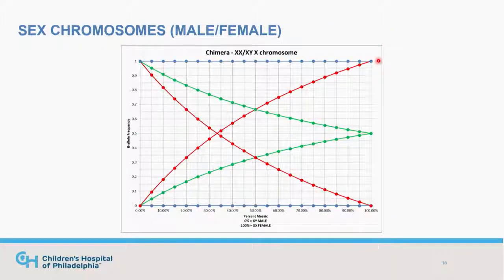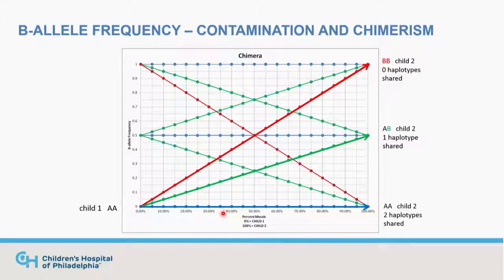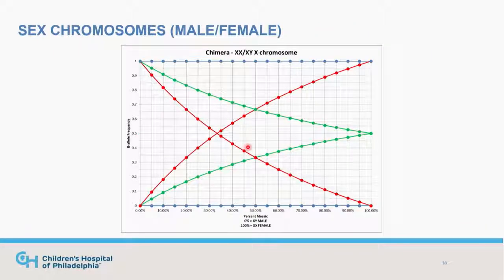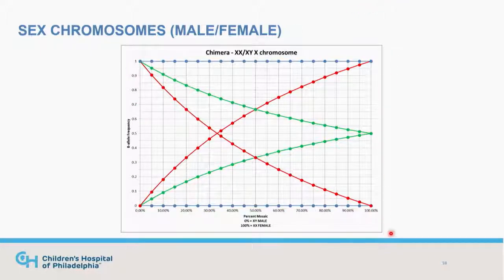One important point: this is symmetric. If you have 20% mosaicism, you can't really tell who is the major and the minor contributor, and there are some percents like 50% where it's actually uninformative — everything lines up. However, if you have an XX/XY chimera, there's actual asymmetry where one side is male and the other is female, so looking at the sex chromosomes can immediately show who is the major and minor contributor.